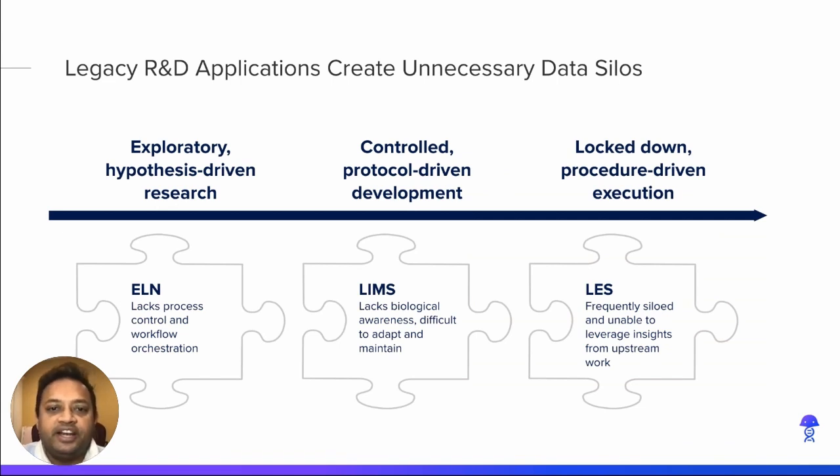To truly meet the varied needs of bioanalytical development, which spans hypothesis-driven research through procedure-driven execution, a modern digital solution should combine the capabilities historically served by disparate ELN, LIMS, and LES software into one unified R&D solution. Modern electronic lab notebooks should not only document experiments and methods, but should also provide sample and resource management. LIMS and LES should have experimental context and biological understanding in addition to core sample traceability. Although processes need to be locked down for compliance reasons, solutions need configurability that adapts to varying program needs.